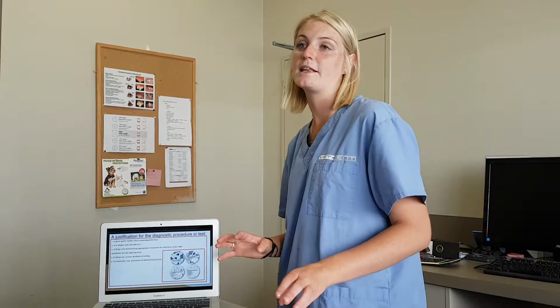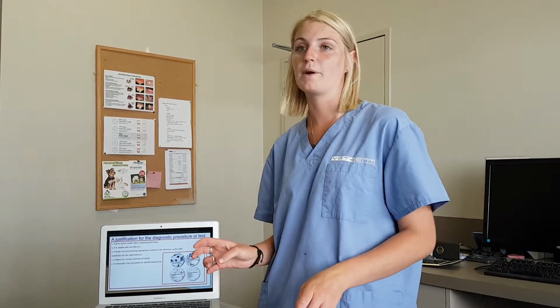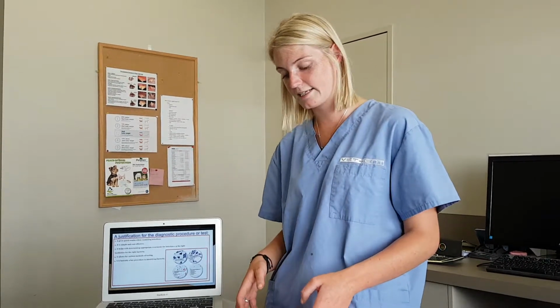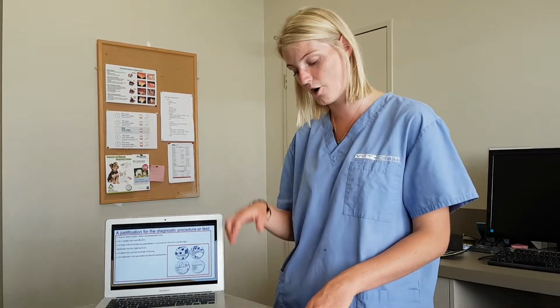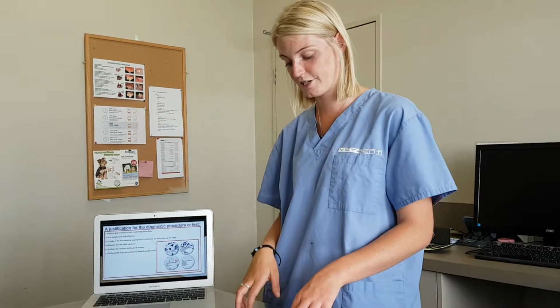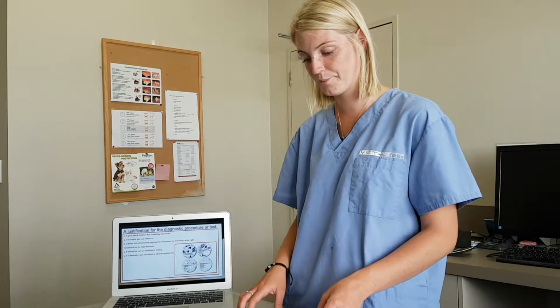So with a gram stain, they can get on to finding out what's actually causing the infection and what bacteria is there, so they can choose the correct antibiotic to give that patient. Even if they don't find an infection and they find something else, then they can determine what to do from there instead of just giving them an antibiotic. Next is, it allows for various methods of testing, and it is basically a key procedure in identifying bacteria, like I just stated before.